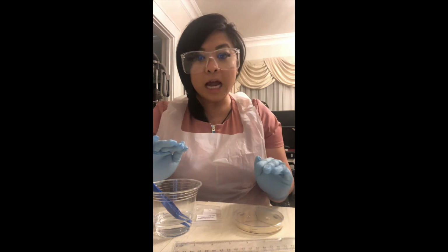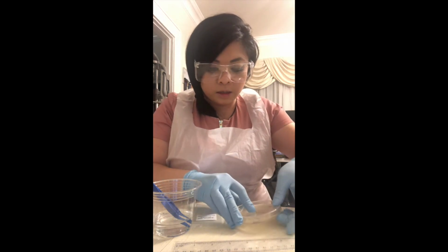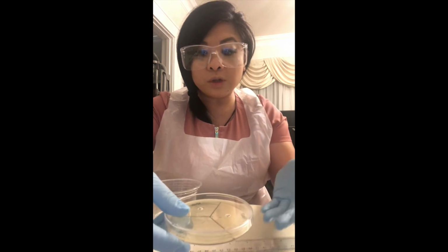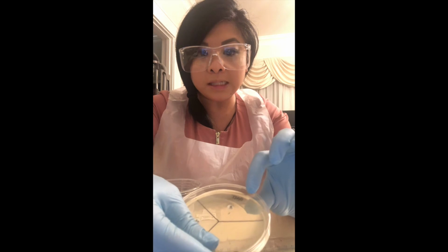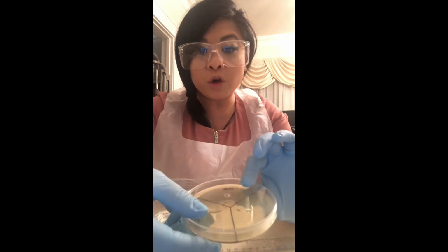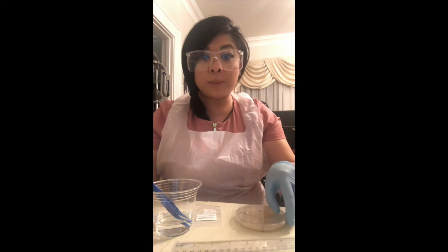And now I already placed the antibiotics in the plate. I've done 2 of the antibiotics. The first disc was the gentamicin, which is this one. I already placed it in the agar. And I also did the novobiocin right over here. And I will demonstrate how to do the penicillin.